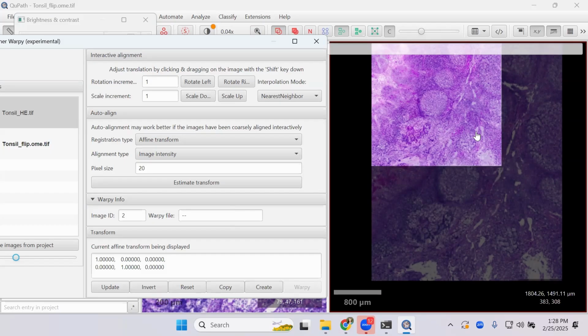And in order to fix that problem, I'm going to need to make some changes to this matrix that is down here below. So you can follow the math that has been done in the GitHub. I warn you, that math is terrible. How many of you know how to do divisions? Ooh, oh, you were talking to math professionals.